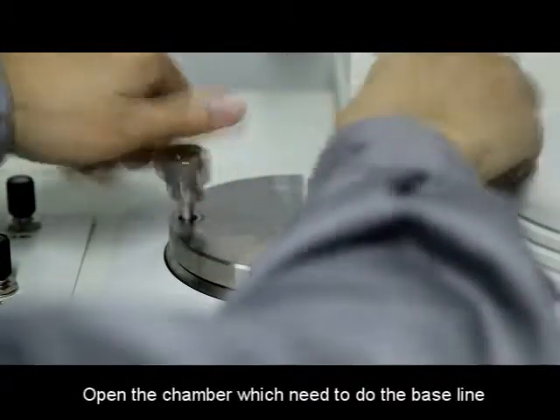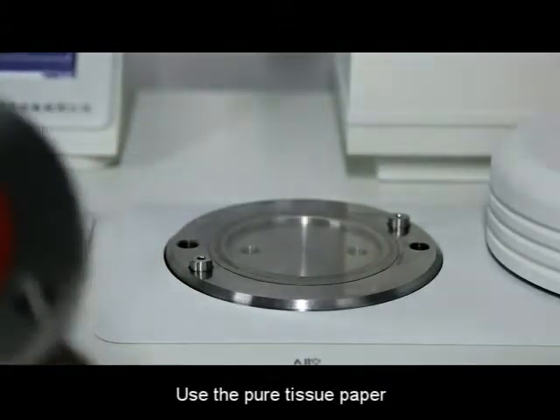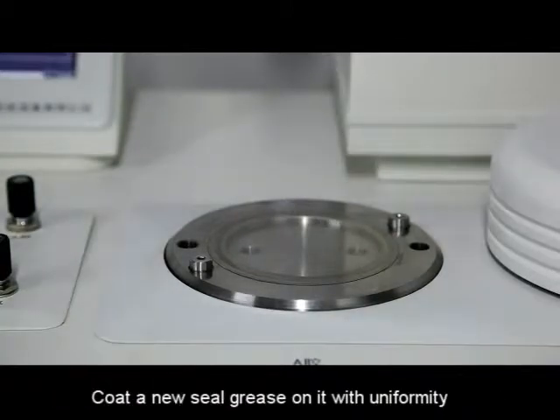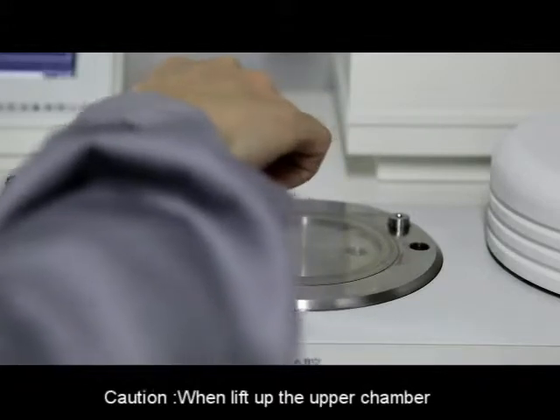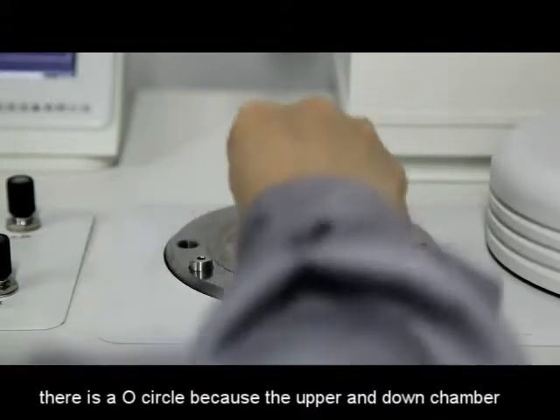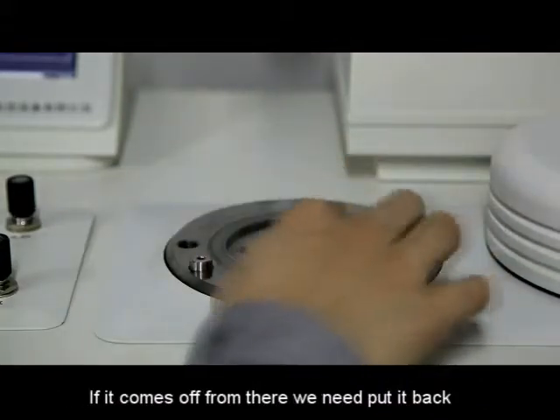Open the chamber that needs the baseline. Use pure tissue paper to clean the seal grease on the chamber and copper plate. Coat new seal grease on it uniformly. Caution: when lifting up the upper chamber, there is a circle between the upper and lower chambers. If it comes off, put it back.